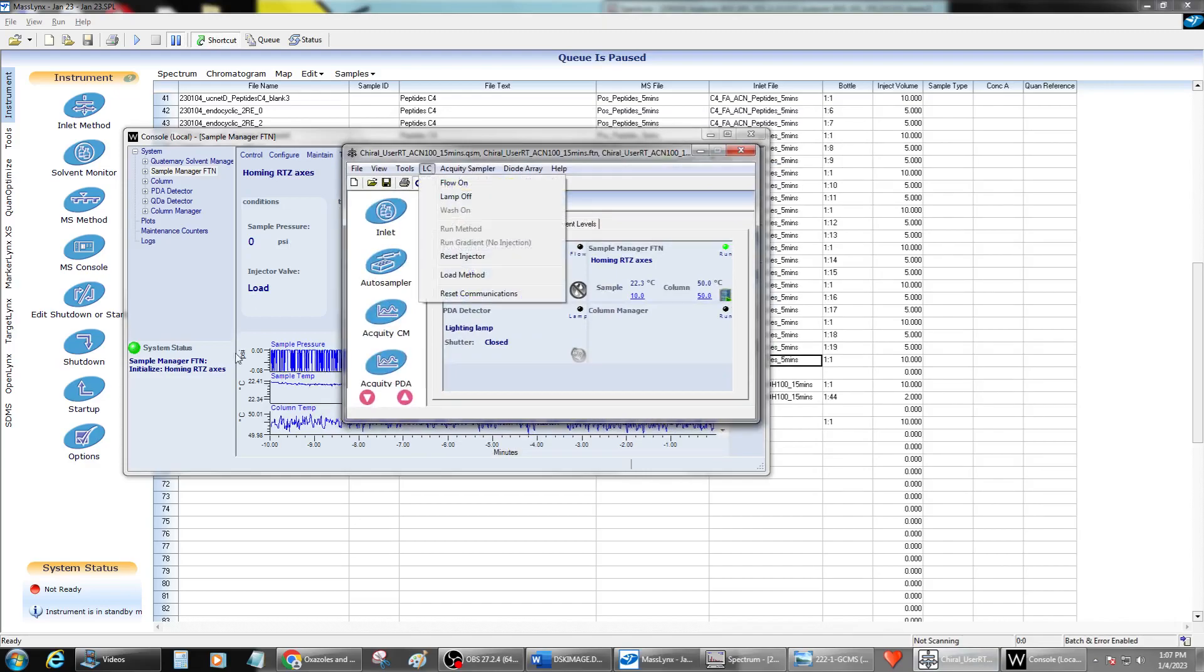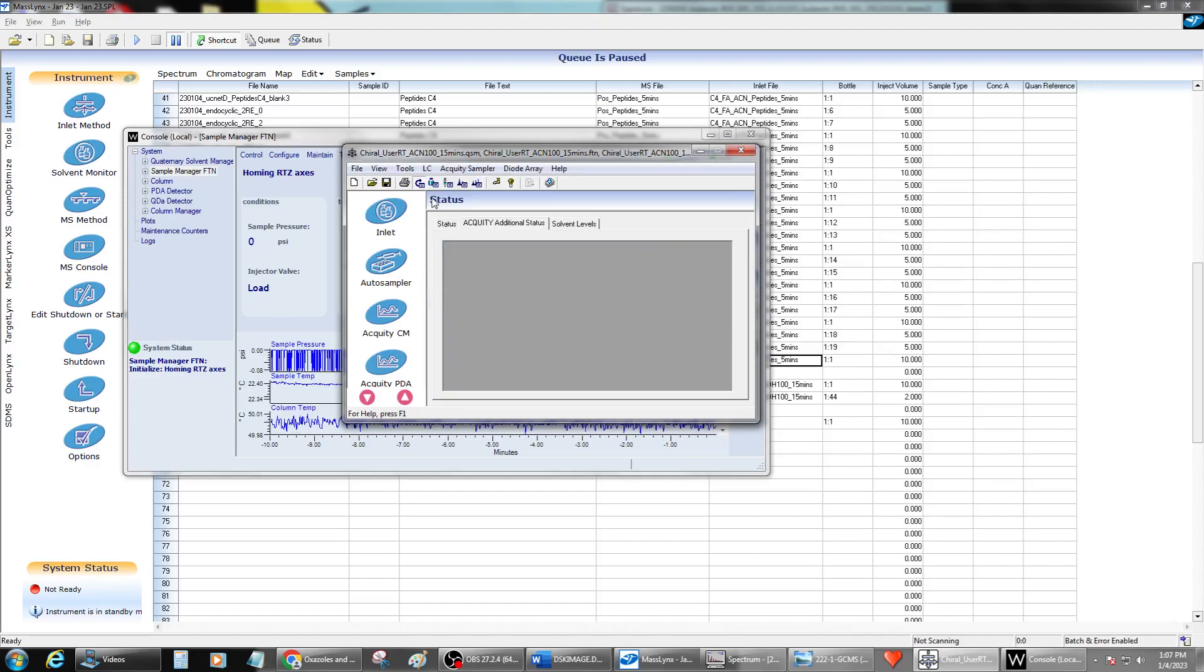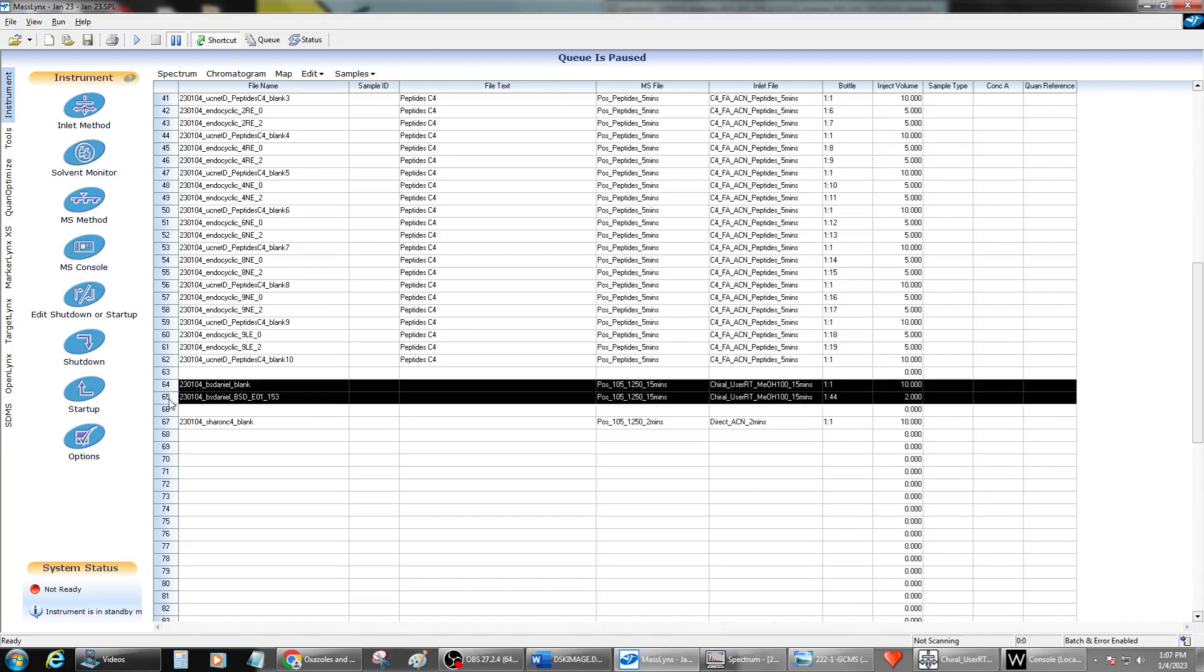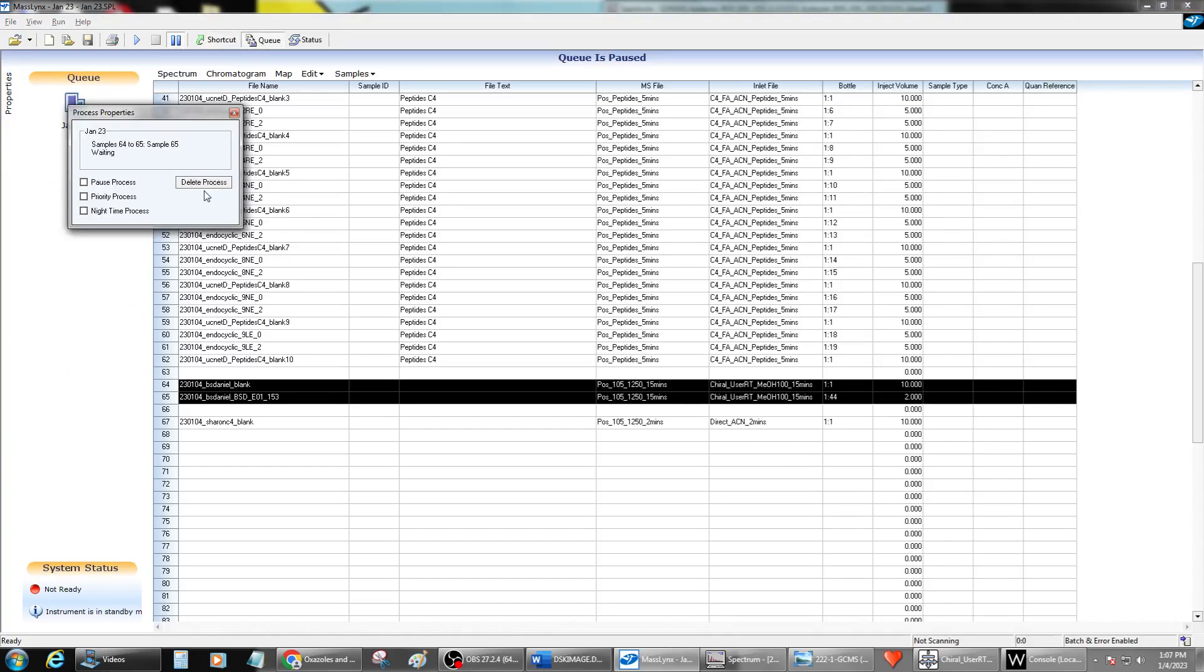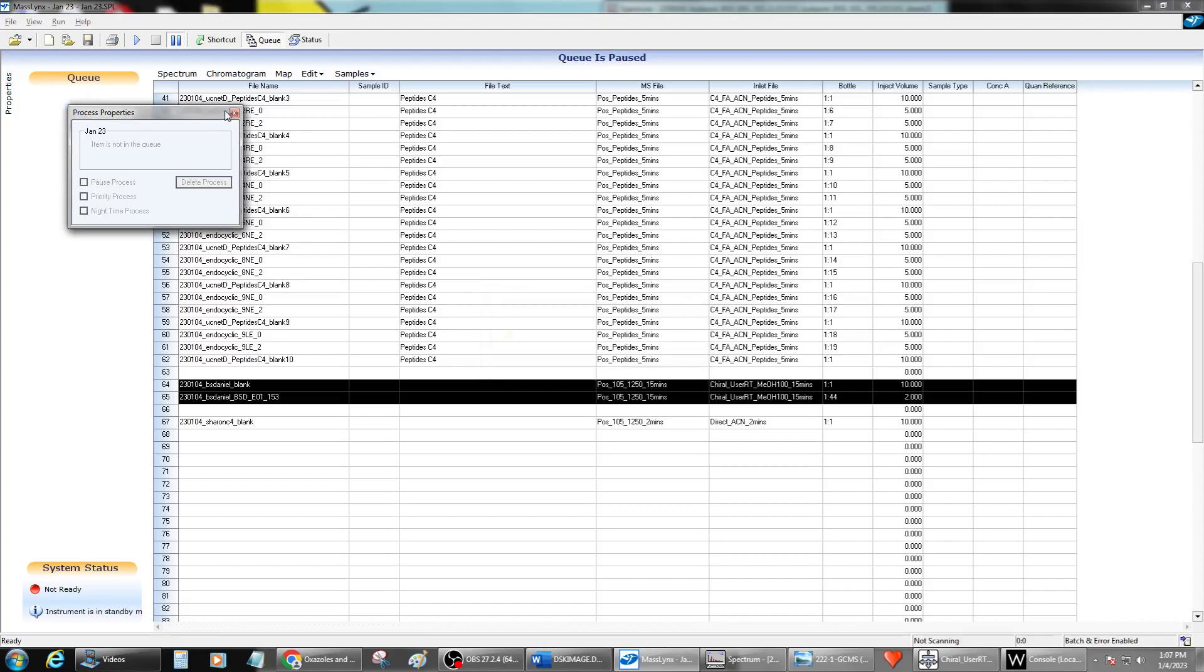And so then I will just come back over. You don't have to wait for it to finish or anything. I just come right back over here to this and reset the communications one more time on the inlet manager. So now I'm going to go over and I'm going to open up. So it looks like the problem was on this method here.